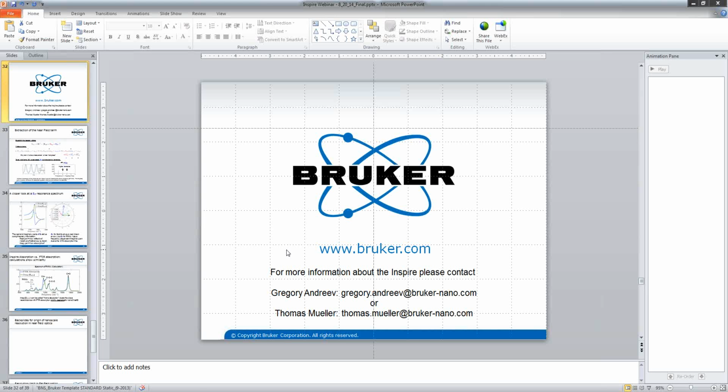So pretty much any material that has a significantly different index of refraction, a complex-valued index of refraction contrast, will show up in this technique. One simply needs to calculate the reflection spectrum, and if the reflection spectrum shows, let's say, 2% contrast, then it's possible to detect. 1 to 2% is easily achievable with this technique.